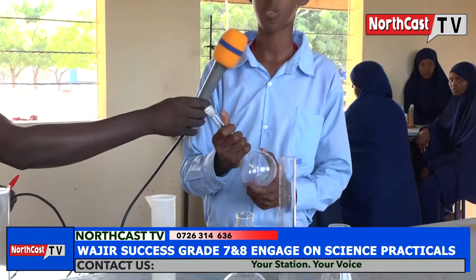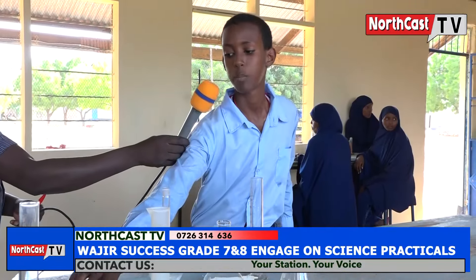Under the category of those used for measuring fixed volumes, we have the volumetric flask. The volumetric flask is used for measuring fixed volumes of liquids. Second, we have the pipette. It is used to measure and transfer fixed volumes of liquids.